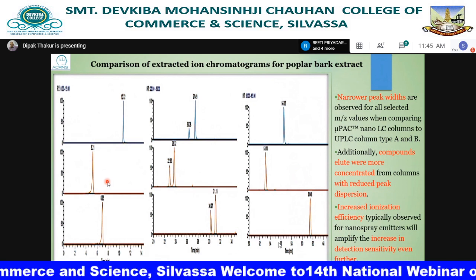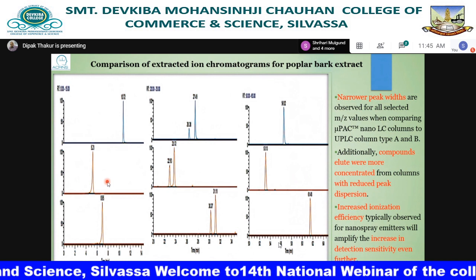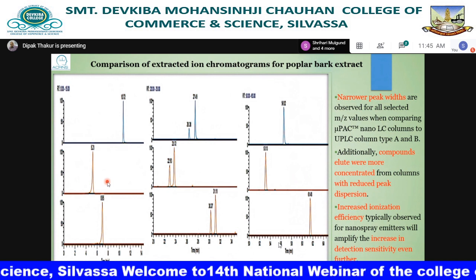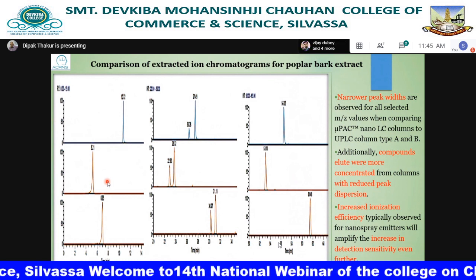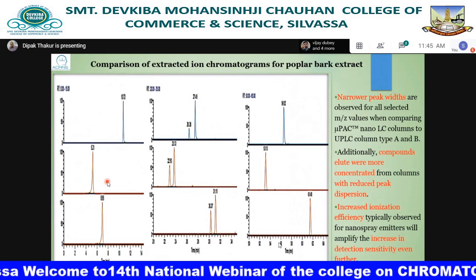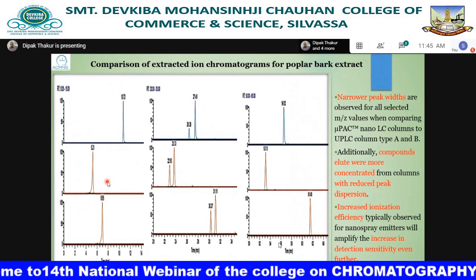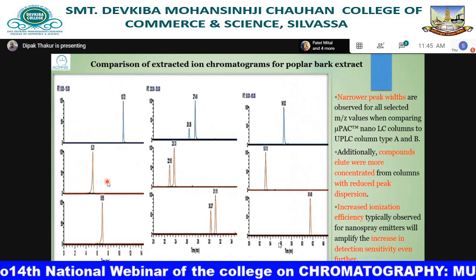Another benefit is increased ionization. I showed you the electrospray ionization. It is so beneficial that you save on gas. You don't need gas to evaporate solvents from the droplets, and everything is ionized. Nothing is lost.